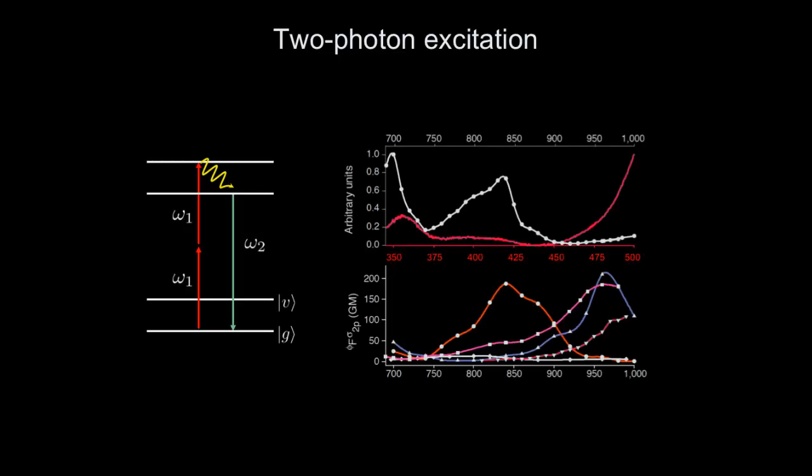This is an interesting graph because people say, okay, you just excite the molecule and it fluoresces. However, you do excite at a different level than in one-photon fluorescence. So please take note of that. You see a comparison. Here, this line, I believe this is NADH, if I'm not mistaken, is a one-photon excitation. And this is the spectrum. So if you put in light through one-photon excitation of this wavelength, you see the absorption is right here. It's the magenta line.